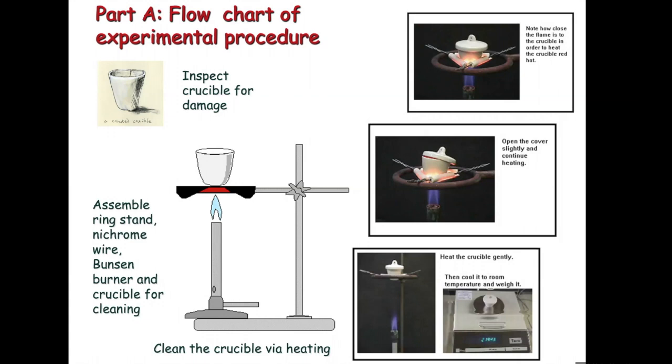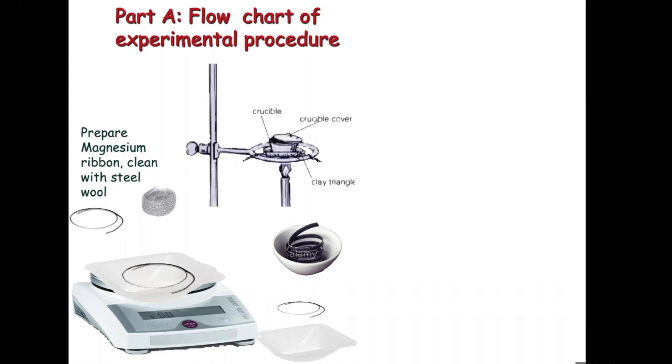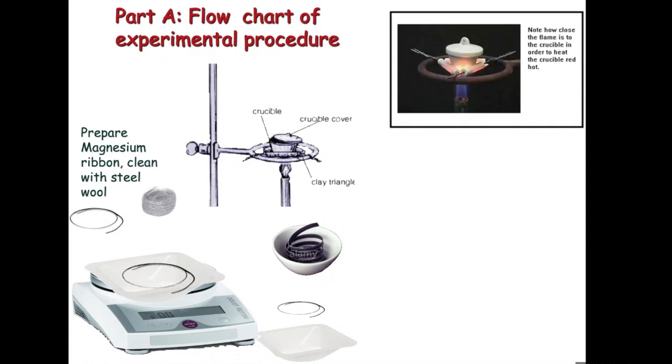So that'll be the mass of the crucible. You don't just take the crucible and weigh it directly because there's junk in there. So that's why you're doing this prep of the crucible. Once you have this, then you take magnesium. You clean it to make sure that there's no oxidation, because the metal is going to oxidize at the surface. So you've got to clean that away because that's impurities. You put it in the crucible, you heat it up, it'll ignite, and it's going to make magnesium oxide and magnesium nitride. Okay, so here's an illustration of that.